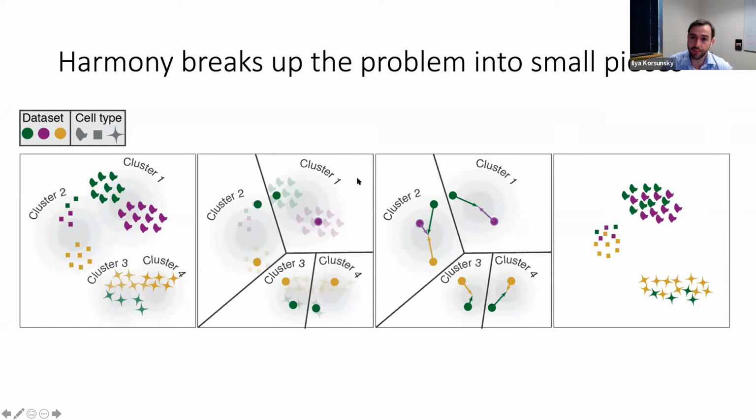If I have one cluster, then harmony just reduces to basic global linear regression. If I have 1,000 clusters and 1,000 cells, I'm not going to correct anything because every cell is going to belong to one cluster, more or less. It's actually not entirely true the way we implemented harmony. If you give 1,000 clusters, it will be robust to that because harmony right now makes it so that you can have redundant clusters. So if there are 12 real clusters and you give 15, 3 of those clusters are going to be folded in, completely redundant with 3 other clusters. So there is some redundancy and fail-safes with this.